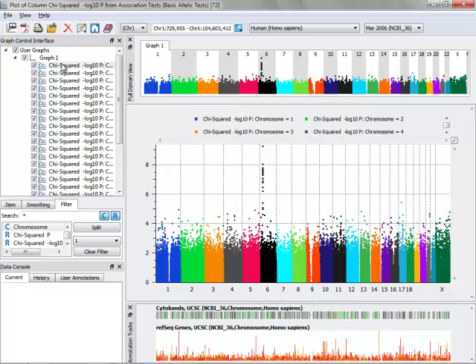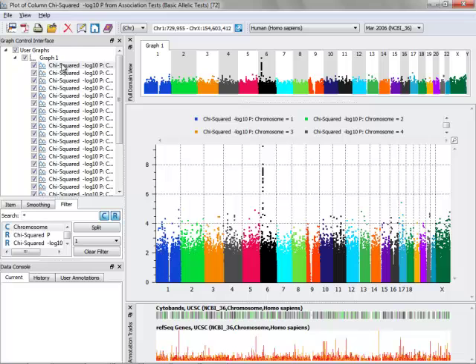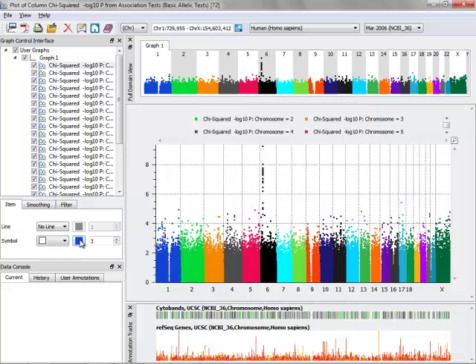You can go in and color each one of these differently by selecting that appropriate graph item, selecting the Item tab, and changing the color if you prefer. You can change to any of the colors we have here or create your own custom colors.